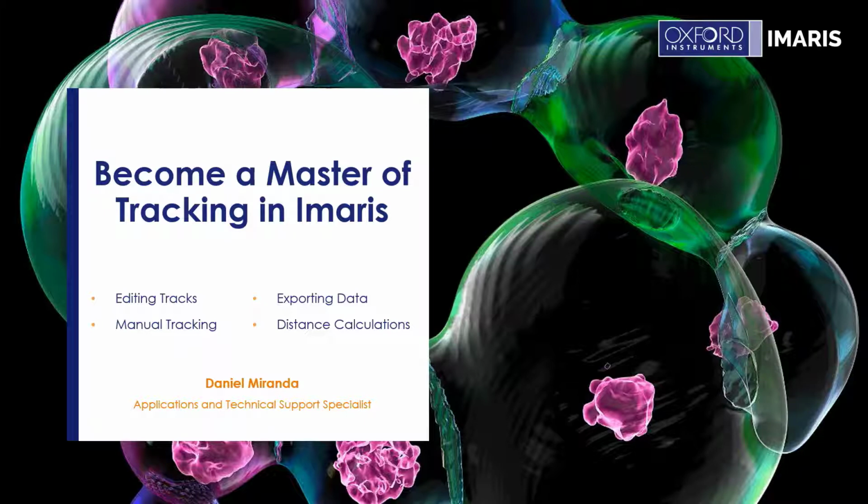So, yeah, what I'll be going over today is becoming a master of tracking in Imaris. This is time-lapse data. We're going to be doing some 2D and some 3D time-lapse data today, and we're going to start off where my colleague Amanda left off last week, and we're going to jump straight into some of the manual tools, editing tracks, exporting the data, and how we can use the distance calculations to help us out. All right.